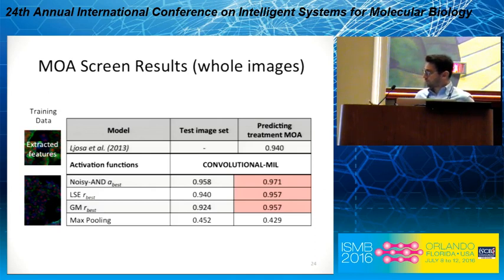One thing to really note from both data sets is that even if the results were similar, our model takes a lot less effort to implement. All you need is the annotations for the whole image and the whole images. There's no segmentation or labeling done per cell. Whereas both the previous approaches required segmentation, feature extraction, and in this case, they didn't label by eye, but in the yeast data set they do. So ultimately, it's a much easier method to deploy and to train.